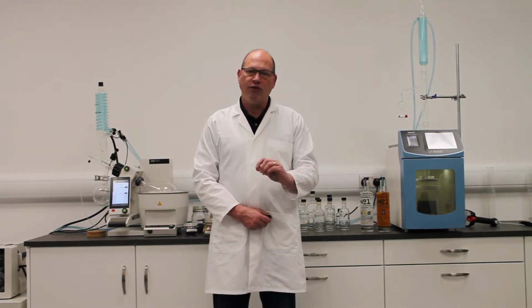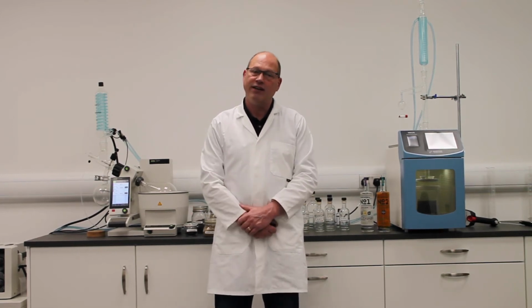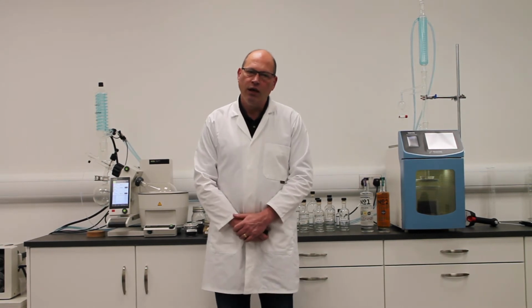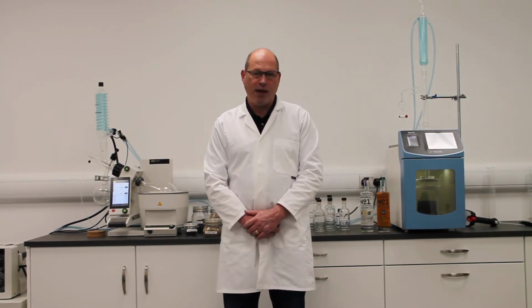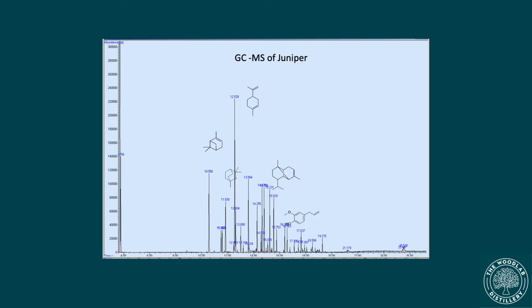Why? Because we minimise the amount of alcohol and the amount of heat that we need to extract by distillation the particular flavours that we're trying to get. So number one, we need to understand the chemistry of the molecules that we want to extract. And so we carry out gas chromatography coupled with mass spectrometry. And here's an example in the slide where we've got juniper. And you can see the various peaks that go from left to right, separated via their volatility. Each of those peaks then gets analysed via mass spectrometry, which is essentially facial recognition for molecules.